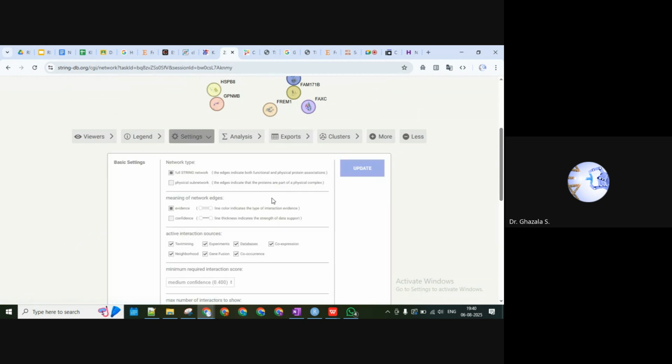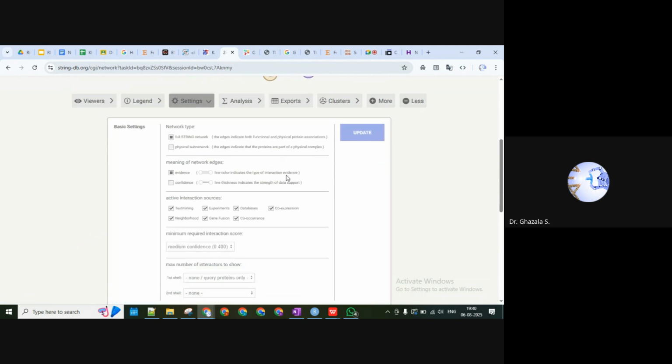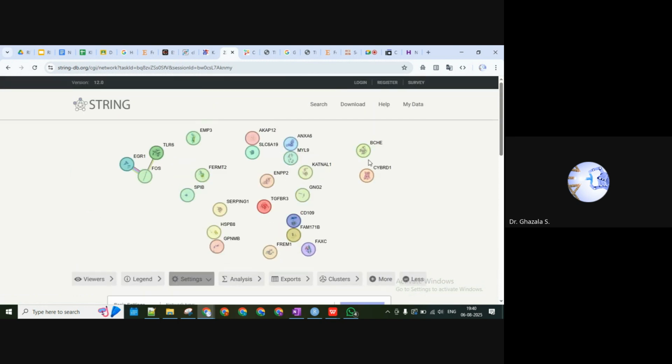Here we can see the gene we are more interested in, and the other one. But now we have a settings option where we can modify the settings to see whether any connection is present between these two genes, because we know that one gene is highly active in different types of tumor microenvironment and different cell types, and for the other gene we don't have any information. So if the expression of one changes, and they are correlated, the other gene might have a probability of being affected if they are co-expressed together or locally present.